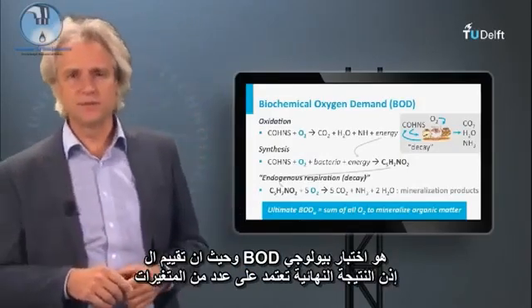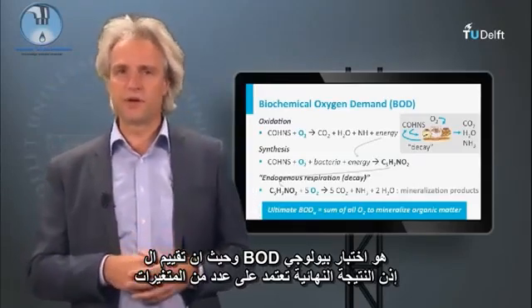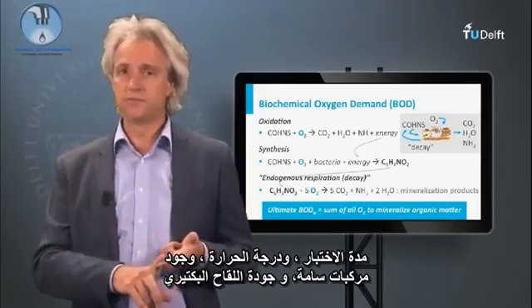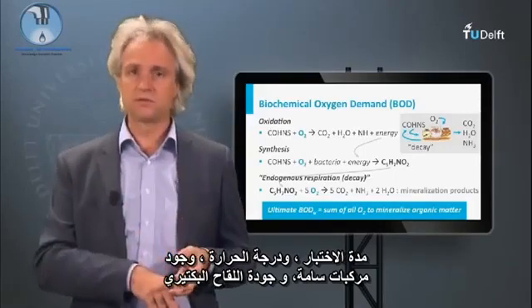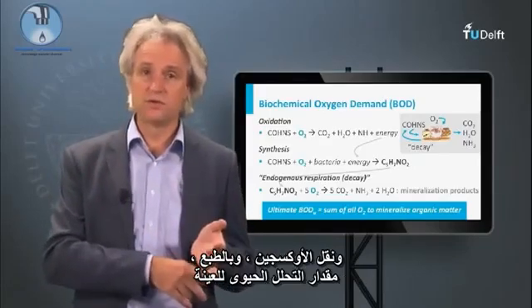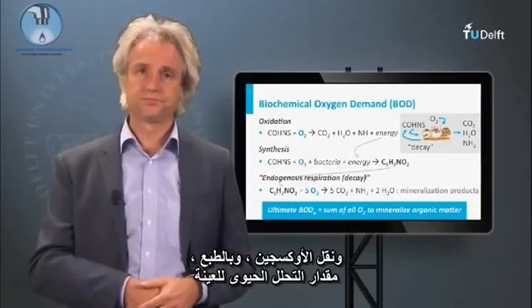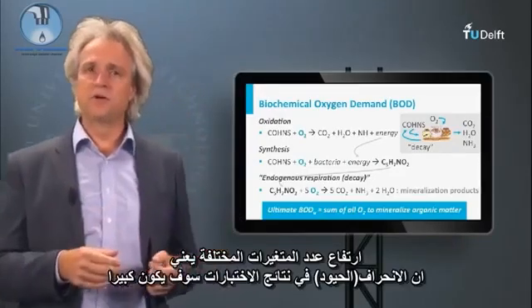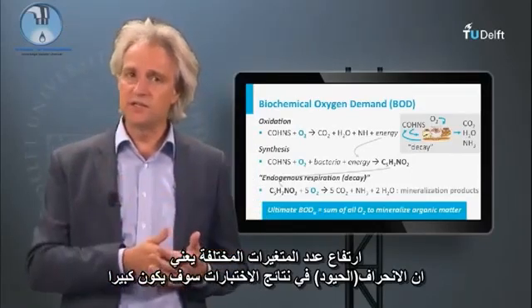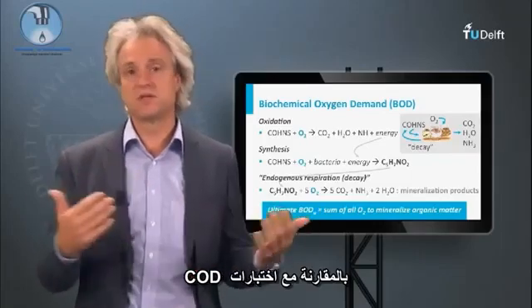Since the BOD assessment is a biological test, the final result depends on a number of parameters: test duration, temperature, the presence of toxic compounds, the quality of the bacterial inoculum, the oxygen transfer, and of course the biodegradability of the sample. The high number of variable parameters means that deviation in test results will be much larger compared to the COD test, which is a chemical test.